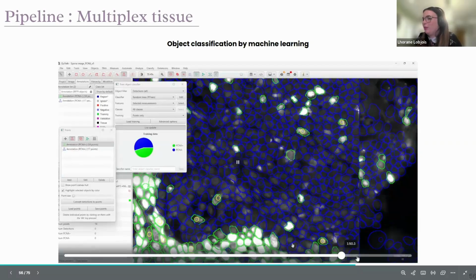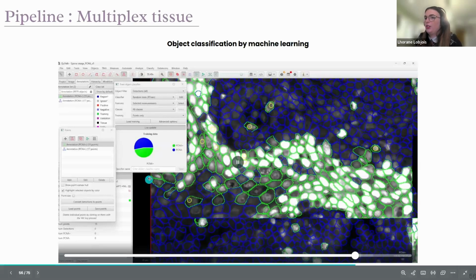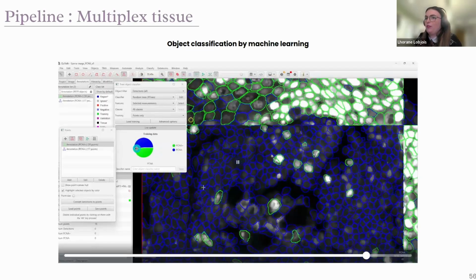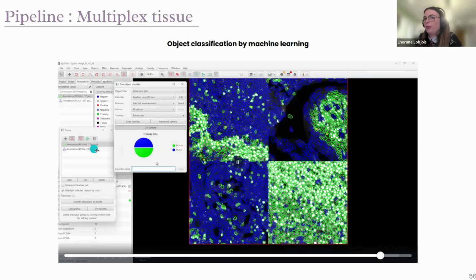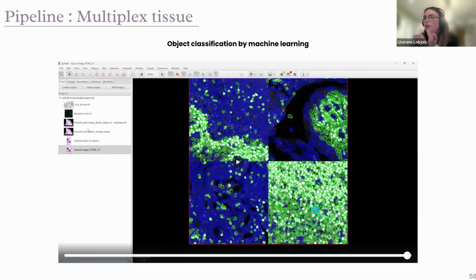And maybe the video is quite long because I do a lot of examples with positive and negative. The goal of this is to have almost, if possible, the same number of points per class. If it's 50-50, it's not the representation of the number of cells on the image, it's the number of dots the model learns. So if you have 50-50, it also recognizes the positive and the negative at the same percentage. So it's a good model if you have something like that.